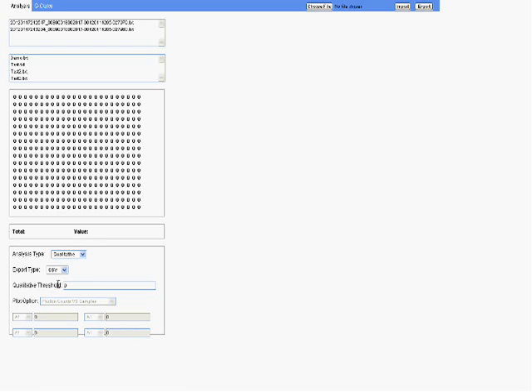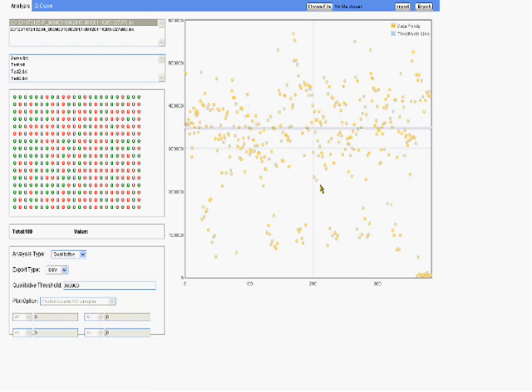And then once you have the files imported, you can decide what you'd consider a hit or containing the protein, or on the other hand, not having the protein. So if it's above this, it has it. If it's below it, it doesn't have it. Once we have the qualitative threshold, you can select the file you'd like to visualize, and this will plot the data, and you can see the threshold line here in blue, and then you can hover over any of the plots so you can see the values on the left.